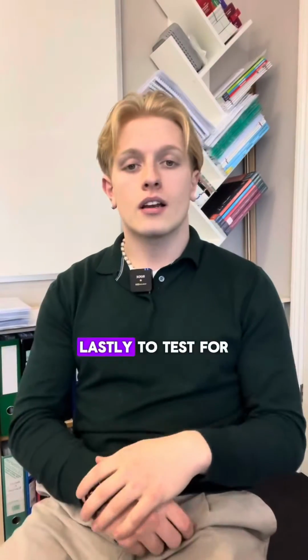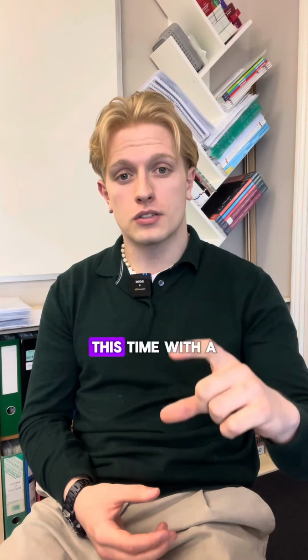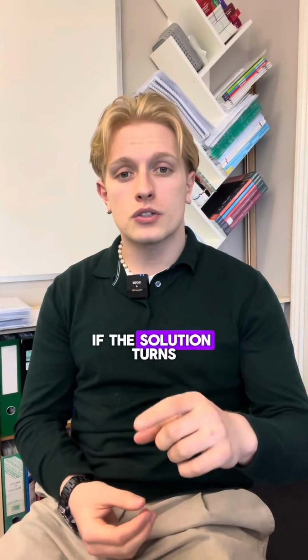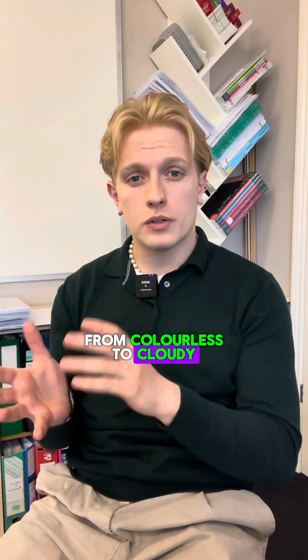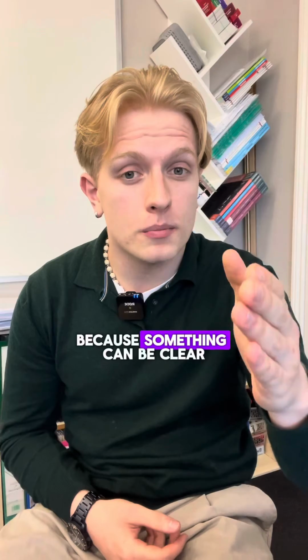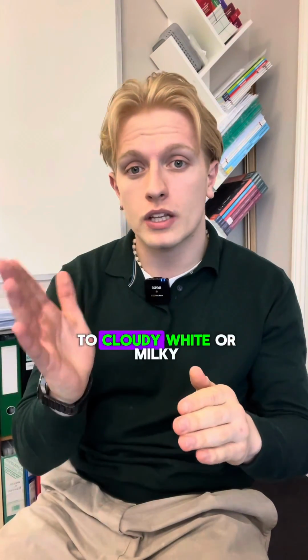Lastly, to test for fats or lipids, do the same thing again and add it into a boiling tube this time with a bit of water and ethanol. Give it a shake. If the solution turns from colourless to cloudy or milky, that means fats are present. Make sure for this one you don't say clear, because something can be clear but still have a colour, okay? You must say colourless to cloudy white or milky.